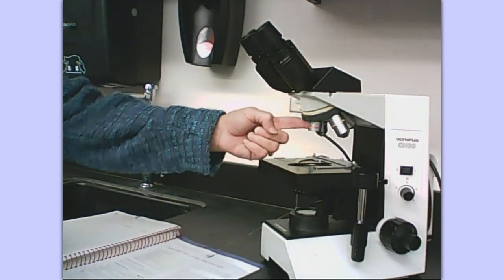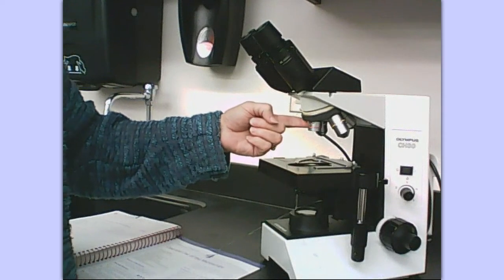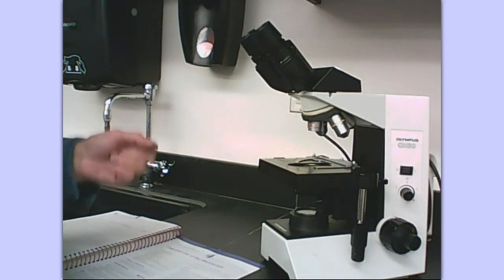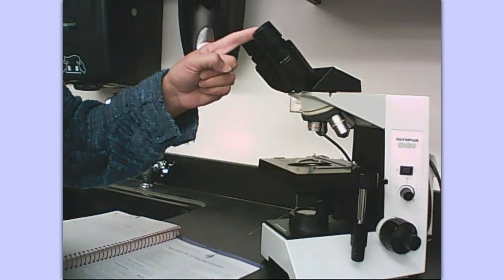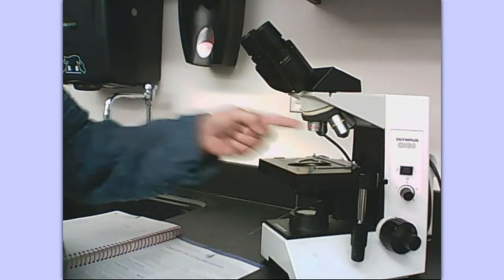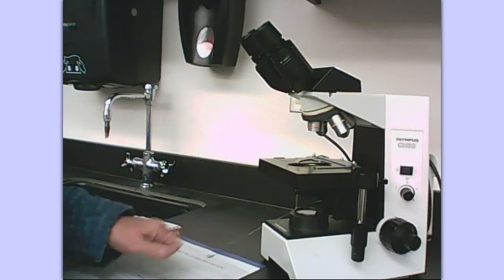We have a short objective here. On this objective there is going to be a little four — that objective magnifies things by four times. Remember, this is a compound microscope, so you have two sets of lenses. To find total magnification for that particular objective, we multiply four times ten, giving us forty times total. This shortest objective is called the scanning objective. Some microscopes do not have a scanning objective, but ours does — we have a pretty expensive and very good microscope here.